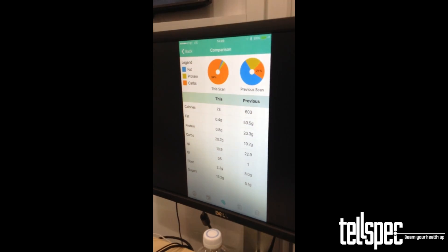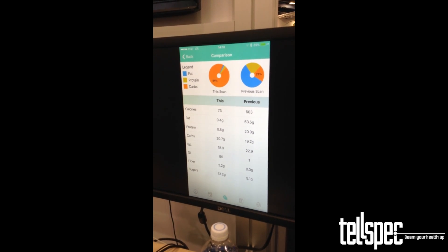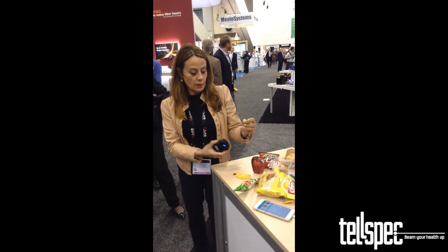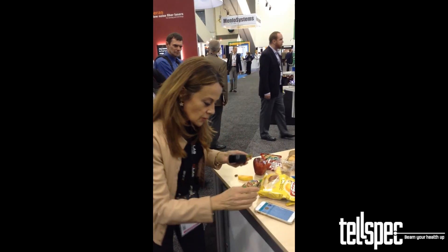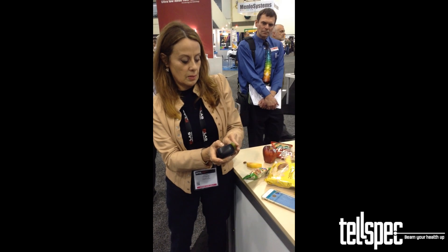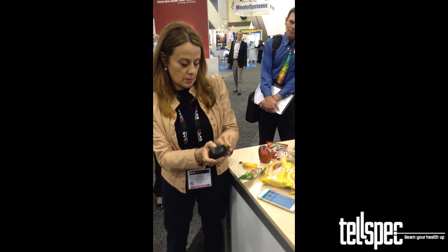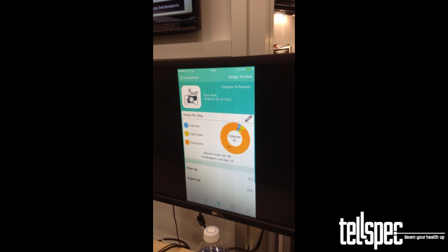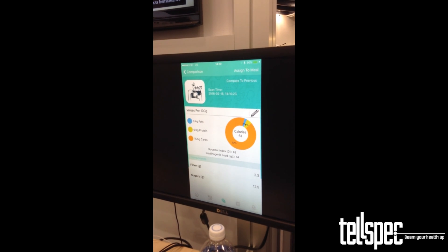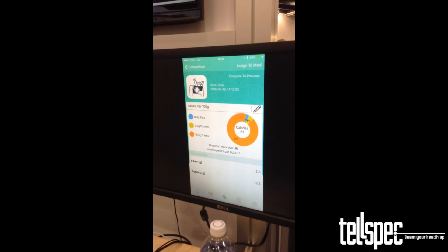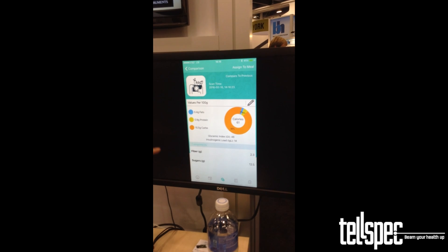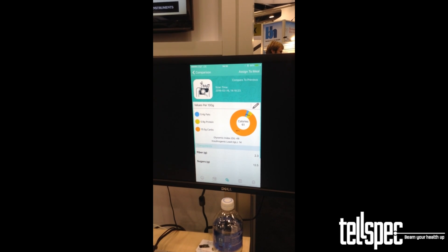Now let's scan something else. I'm going to take the kiwi. I'll go back to scan. You see the light — that's the kiwi. The kiwi is much less in calories, much less in fat, and high in fiber.